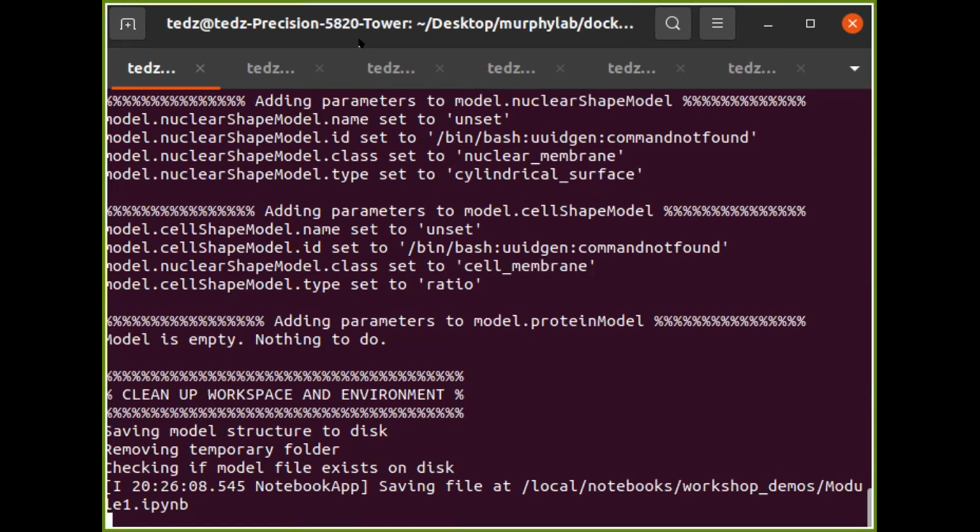So I would just copy and paste the same URL... not the same, it'll be a different URL this time. Also, I have to rerun the whole thing again, is that what you're saying? No, hold on. Close your browser. You've already Control-C'd out of the Docker. So run the Docker command. It will give you a new URL.